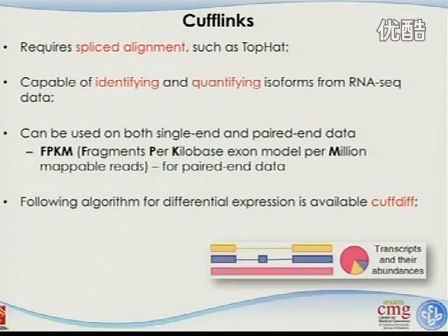And there are some following algorithms for Cufflinks. It's called Cuffdiff, and can help you to identify the differential expression of 2 different isoforms in 2 different conditions. Okay? Are we okay with Cufflinks? So conceptually, what I have said is you first do the alignment and then identify a minimum set of incompatible reads and then build the graph. That's the trick. Okay? As Yang mentioned, we may miss something.